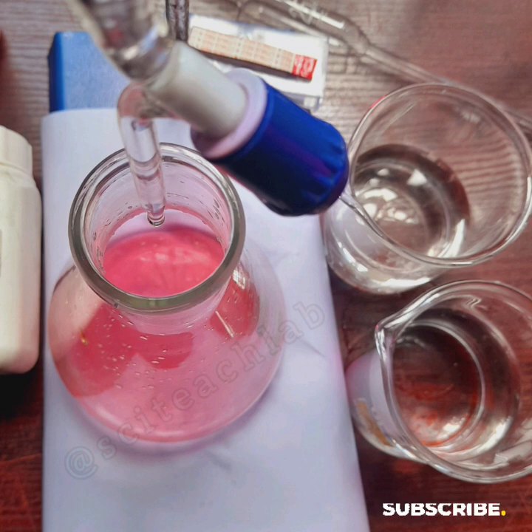Also, when a strong acid is titrated against a weak base, the solution will be slightly acidic at the end point. If it was a weak acid titrated against a strong base, the solution will be slightly basic because the salt that will be formed will be hydrolyzed to some certain extent. So in this case, we are using a strong acid, hydrochloric acid, against a weak base, sodium bicarbonate. So the end point will be a little bit acidic. So that's normal. Alright?